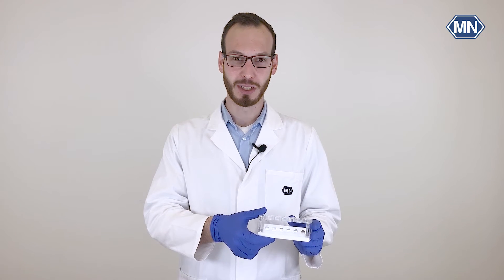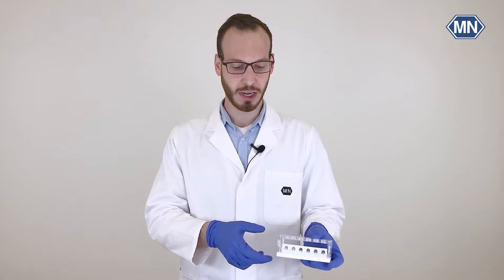Hello and welcome everybody to our today's tutorial. My name is Michael Klees and I'm International Sales Manager here at Macherei Nage. Today I want to present to you our Nucleomag ZEP Mini and how you can conveniently extract and purify nucleic acids using our magnetic bead technology.